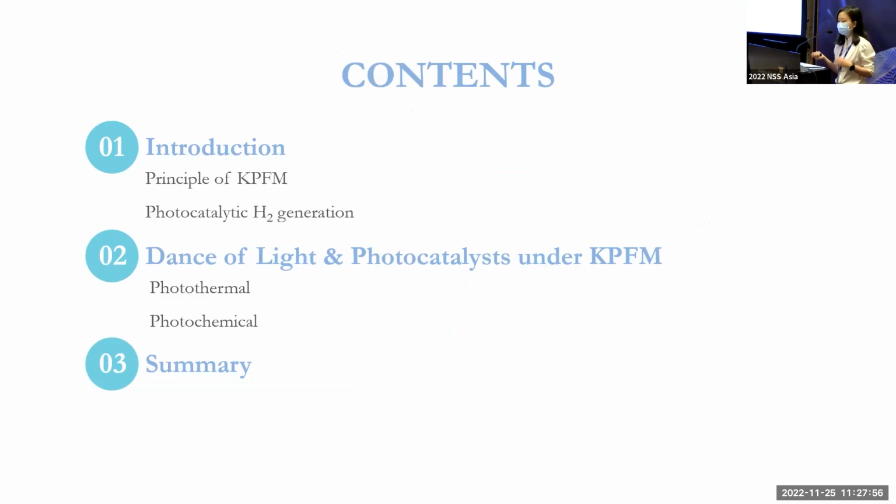Firstly, I will go through some basic principle of KPFM and photocatalytic hydrogen generation. And after that, I will show you the interaction between the light and photocatalyst revealed by using KPFM. This interaction includes photothermal and the photochemical interactions. Then I will summarize the content.